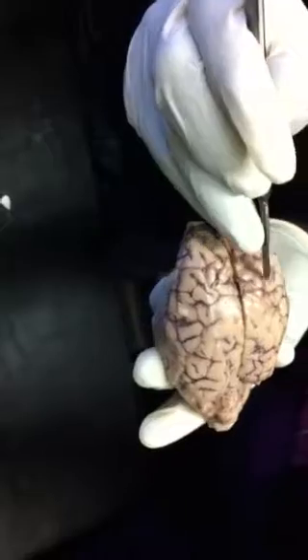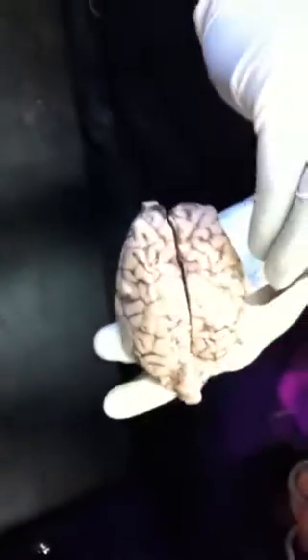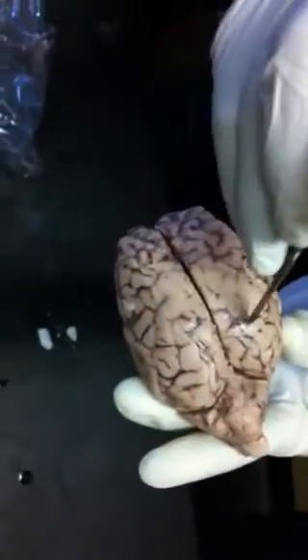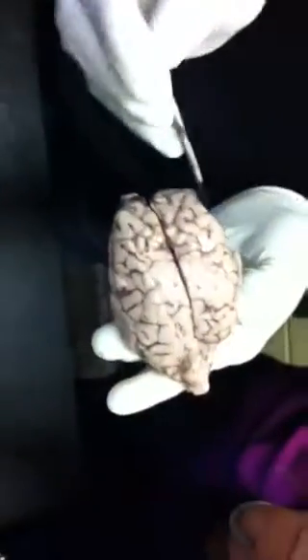So this is a gyrus, this is a gyrus. But the groove in between this gyrus and this gyrus is a sulcus. The grooves are like the lines. The grooves we call sulci, plural; singular is sulcus. While the outward fold is the gyrus.